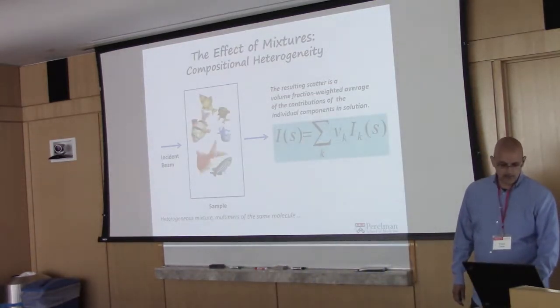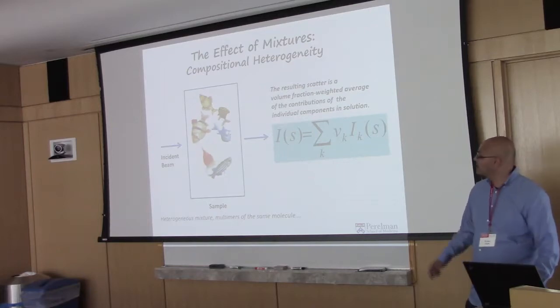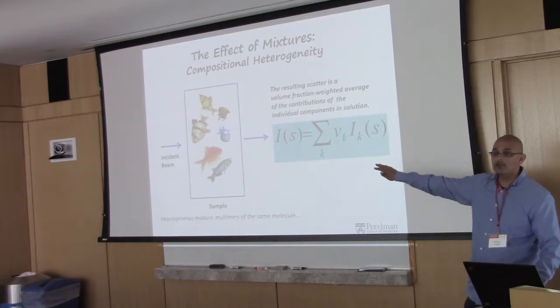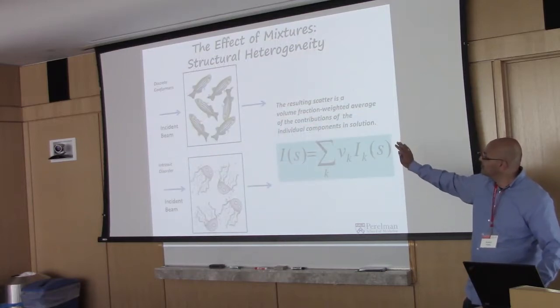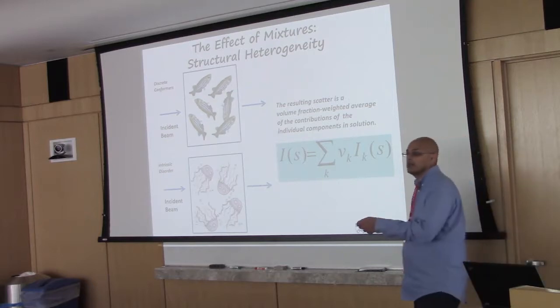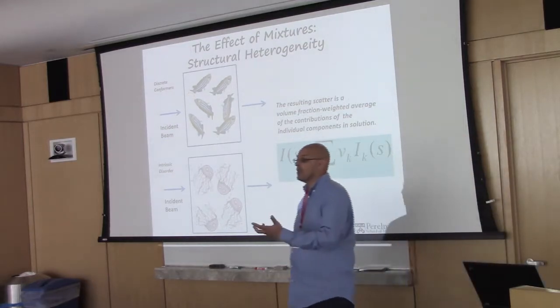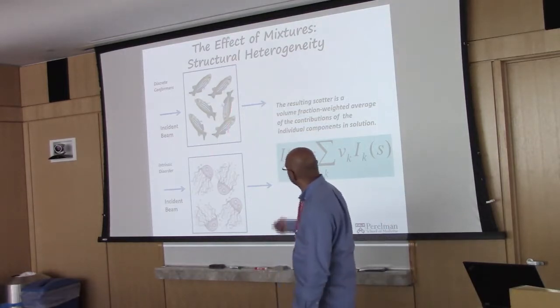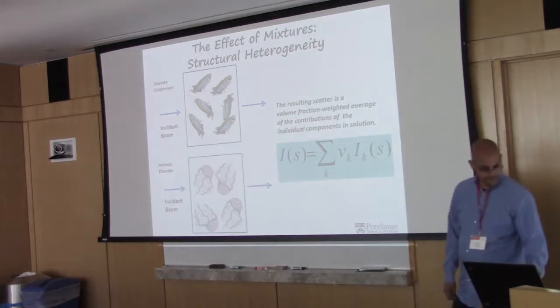with things that are heterogeneous in the different ways that I mentioned before, I'm not going to spend so much time here, whether it be heterogeneity like this, or heterogeneity like this, we have to rely on other methods to get at structural explanations and approaches to our structural hypothesis. And so this we'll come back to with the atomistic model.